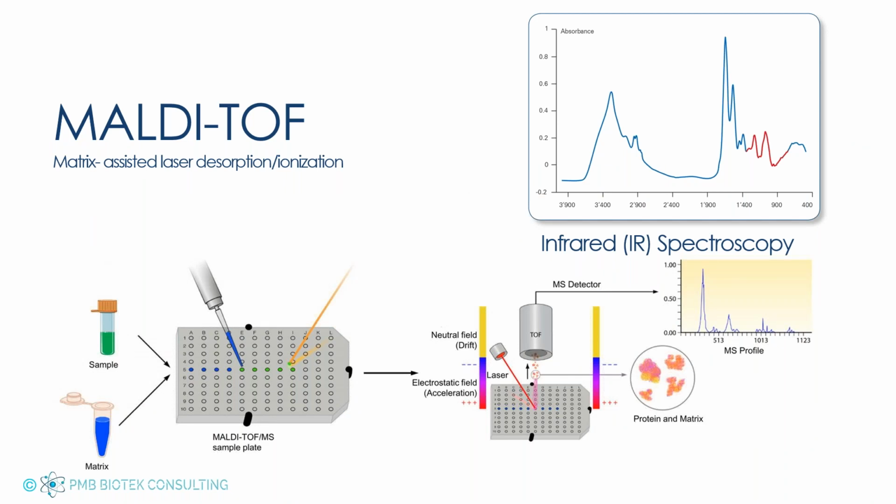Interestingly enough, a couple of the technologies that the food industry is starting to adopt that I could see ultimately moving towards the cannabis industry are MALDI-TOF detection, because of the presence of mass specs at cannabis facilities, or IR spectroscopy.